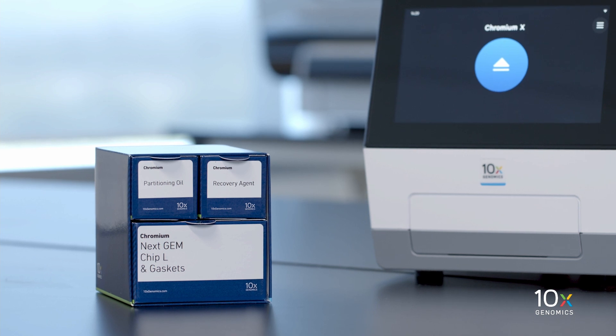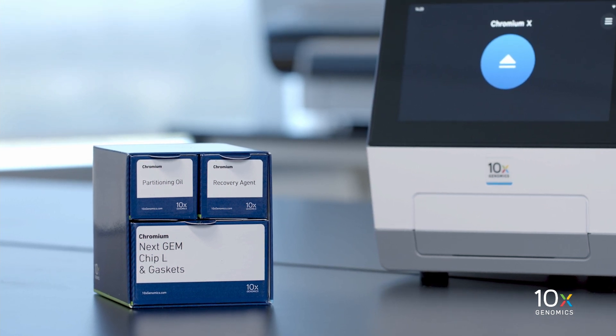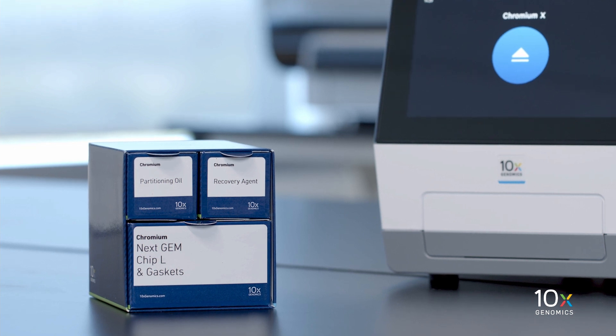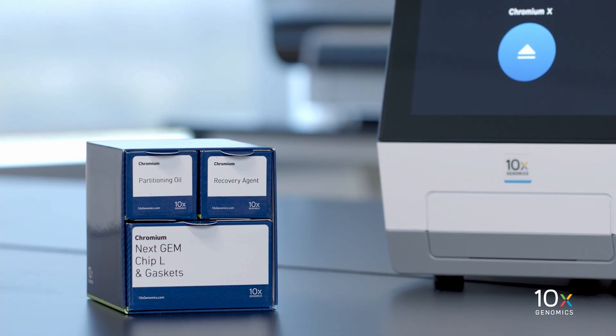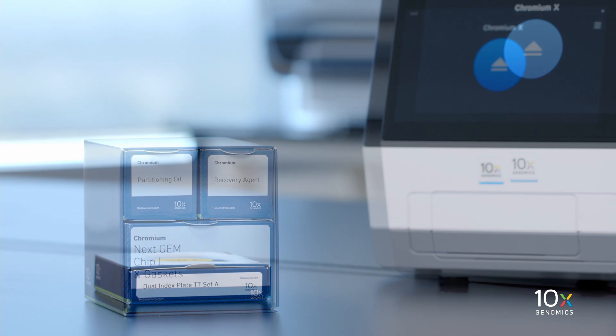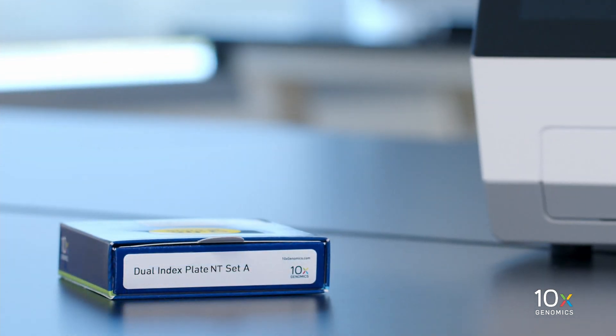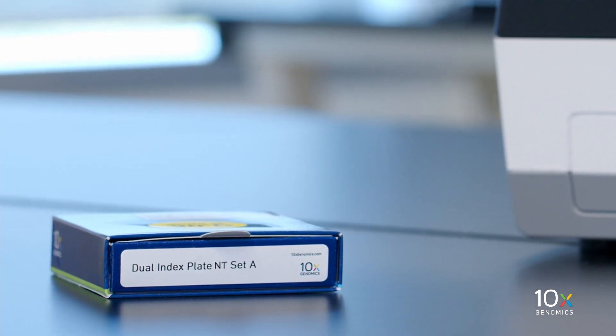The Chromium NextGem ChIP-L Single Cell Kit is stored at ambient temperature and contains Partitioning Oil, Recovery Agent, NextGem ChIP-L, and Gaskets. Finally, we have the Dual Index Plate TT Set A and the Dual Index Plate NT Set A.